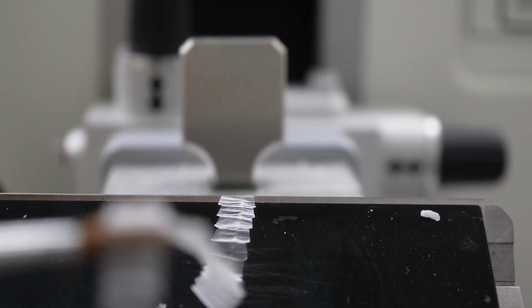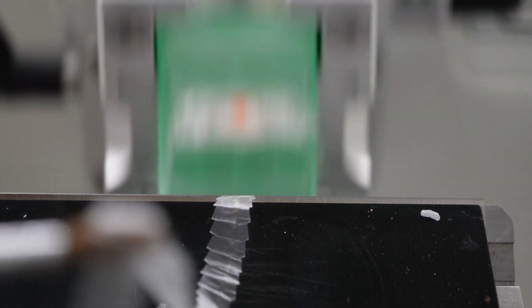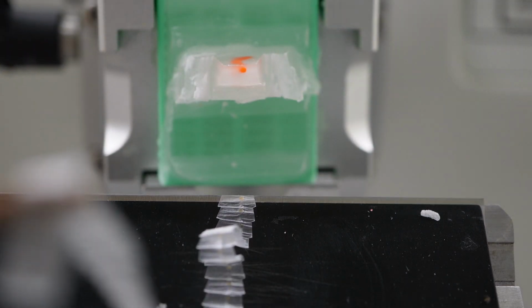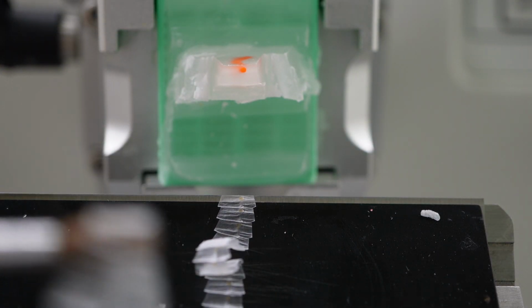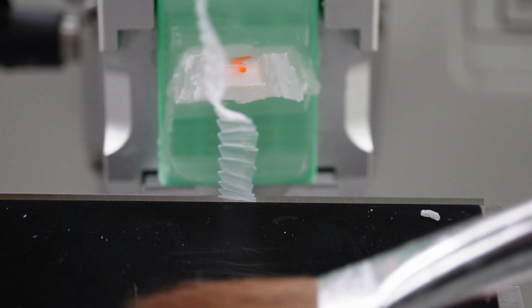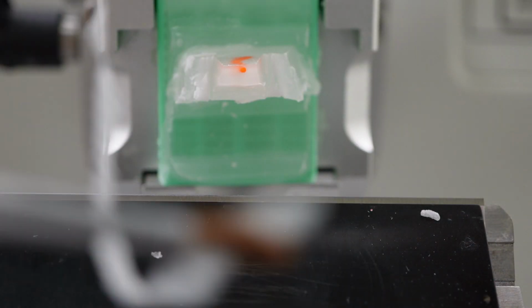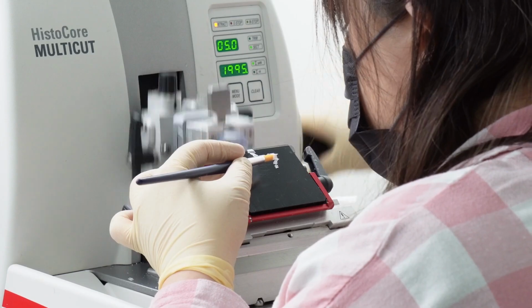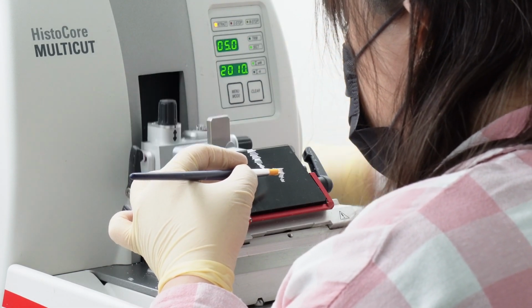Wow. A microtome sounds serious. It is. And the guide brings up another absolutely critical safety warning here. Okay, let's hear it. Essential stuff. The blade on a microtome is unbelievably sharp, like beyond razor sharp, designed to slice cleanly through wax and embedded tissue. Okay. The guide strongly emphasizes, never use one without proper training from someone experienced.